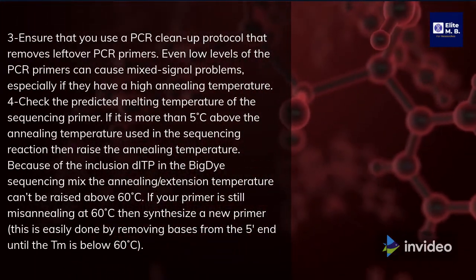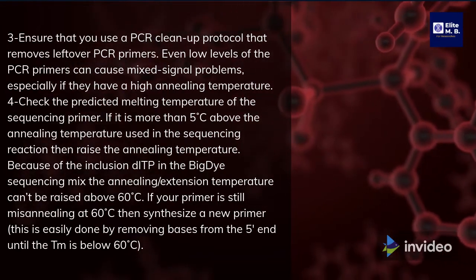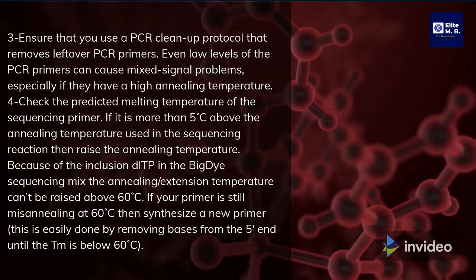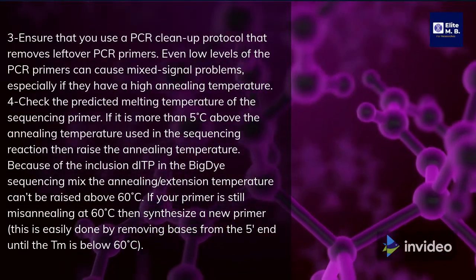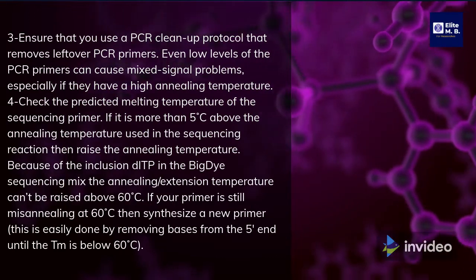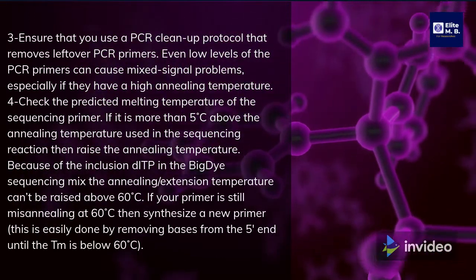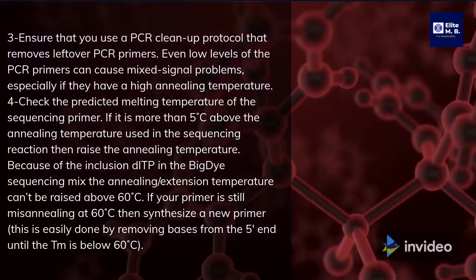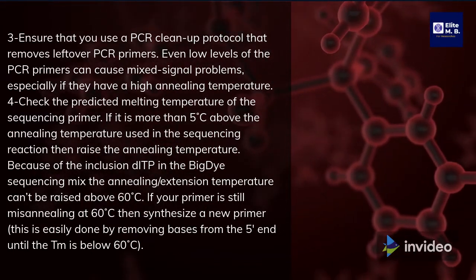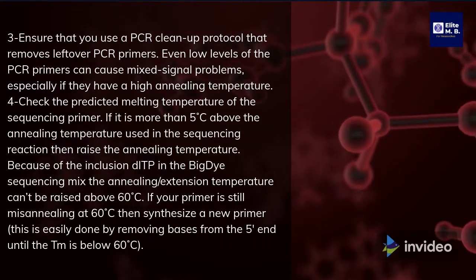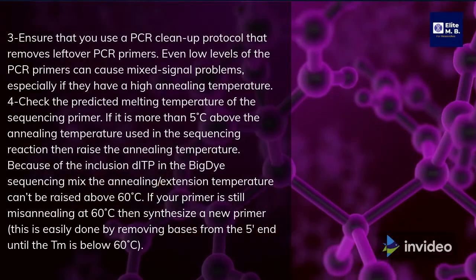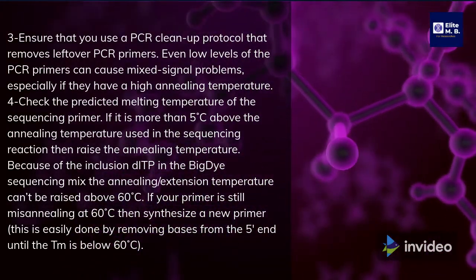Ensure that you use a PCR cleanup protocol that removes leftover PCR primers, as even low levels of PCR primers can cause mixed signal problems, especially if they have a high annealing temperature. Check the predicted melting temperature of the sequencing primer — if it is more than 5°C above the annealing temperature used in the sequencing reaction, raise the annealing temperature. Due to the inclusion dITP in the BigDye sequencing mix, the annealing/extension temperature cannot be raised above 60°C. If your primer is still misannealing at 60°C, synthesize a new primer by removing bases from the 5' end until the Tm is below 60°C.